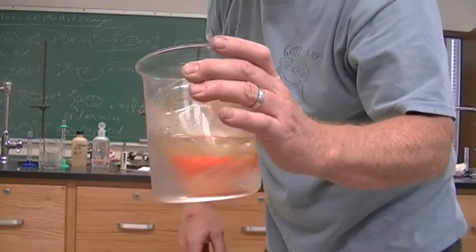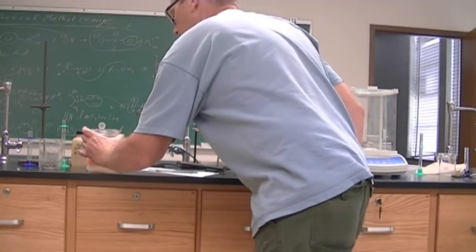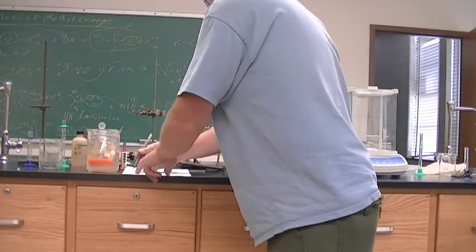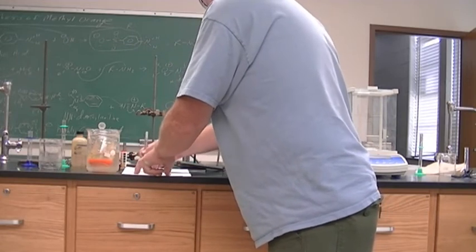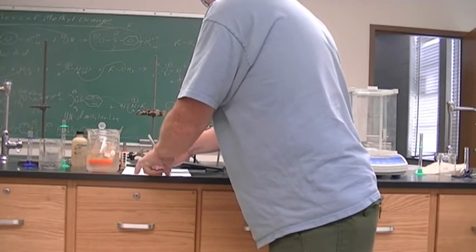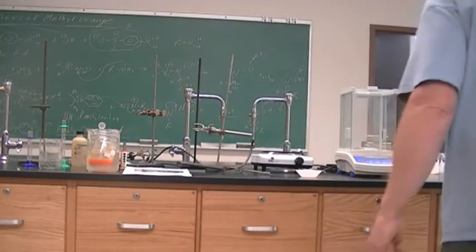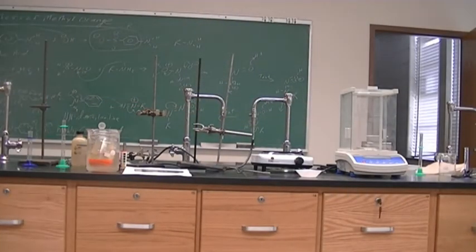All right, so then we just collect that solid by suction filtration. And then we're going to wash it with some cold water, so let's get another ice bath going. Some cold water.